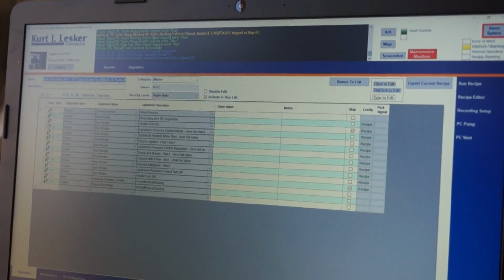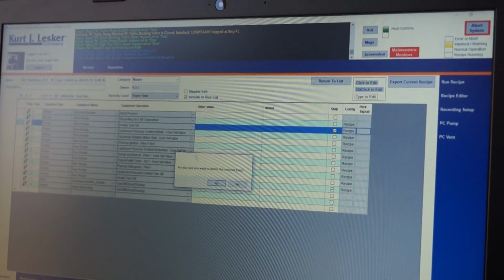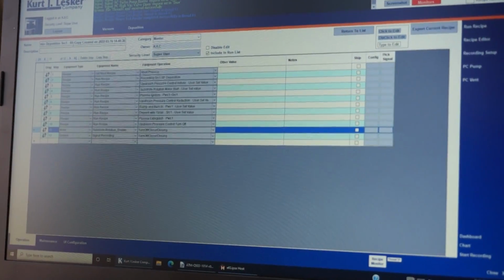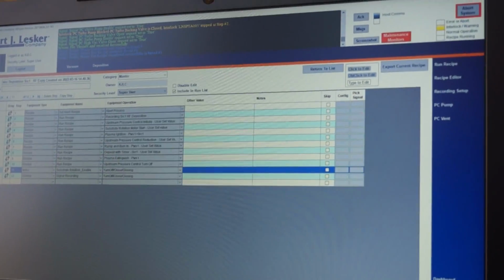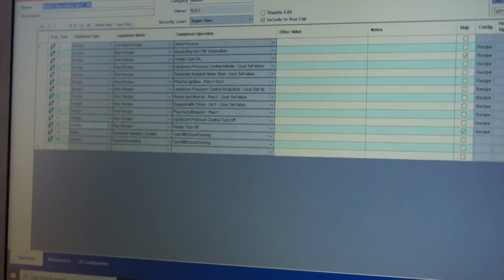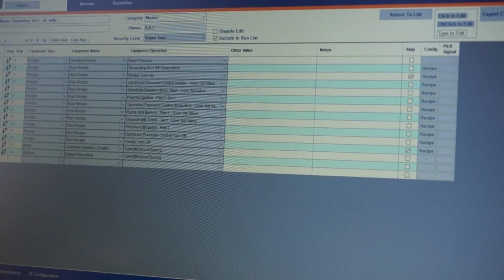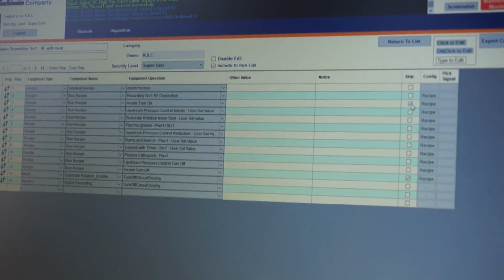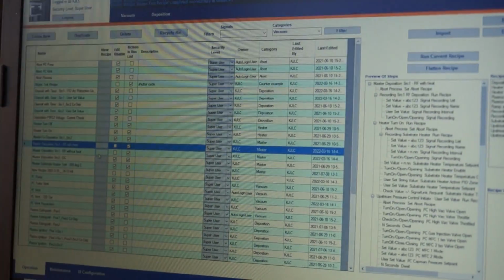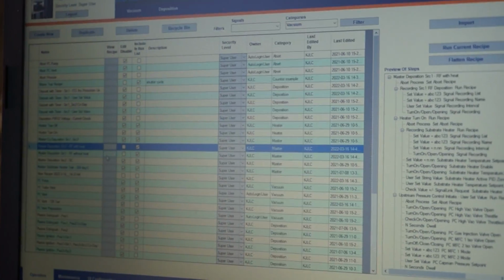So this one here, you don't want to run heating and everything, I take it. I'm just going to eliminate that. So you are saving those to the system now? Yeah, those are the kind of templates. I'm just going to put without heat. This is how simple it is to nest recipes, unnest recipes. I really don't know what you ultimately want to do, but you can just make a series of sub recipes and do what you want.